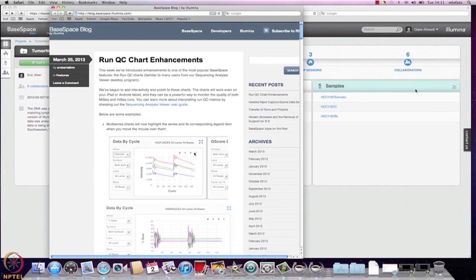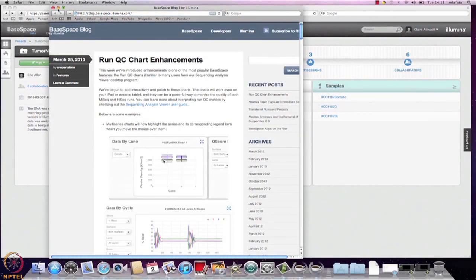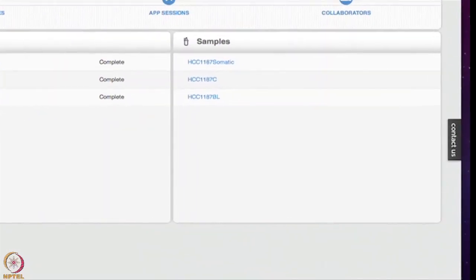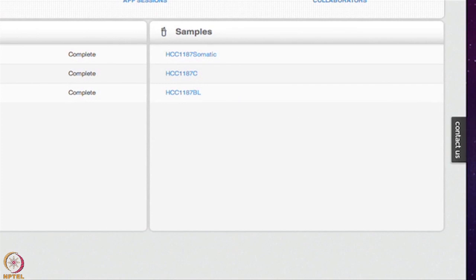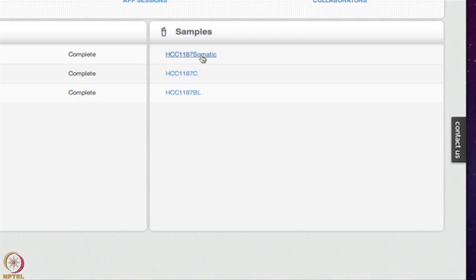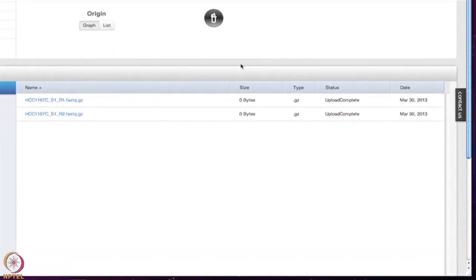You can also access the BaseSpace blog from this page. The blog provides useful updates and information on BaseSpace. There are three samples for this dataset. HCC 1187C is the cancer sample from the breast ductal carcinoma cell line. HCC 1187BL is the matching lymphoblastoid cell line from the same individual, representing a normal sample. HCC 1187 Somatic represents the subtracted data — the normal and tumour samples are compared and matching sequences removed, leaving only the tumour-normal differences.